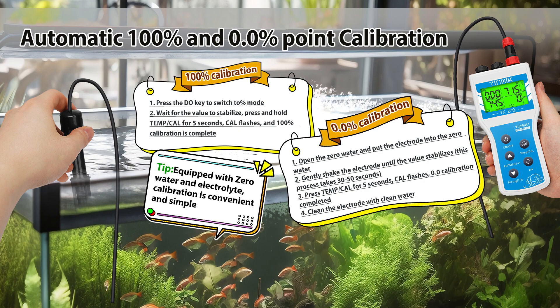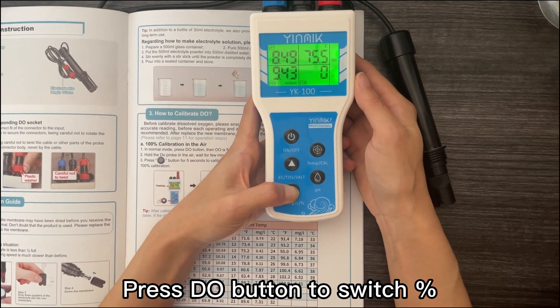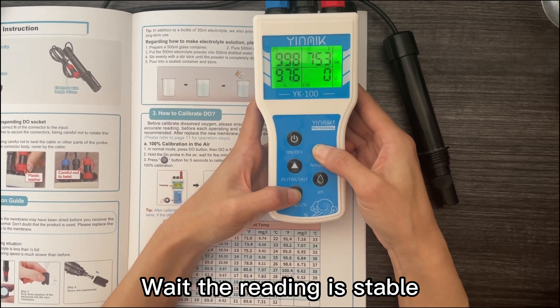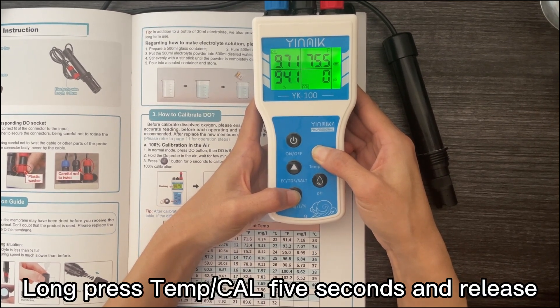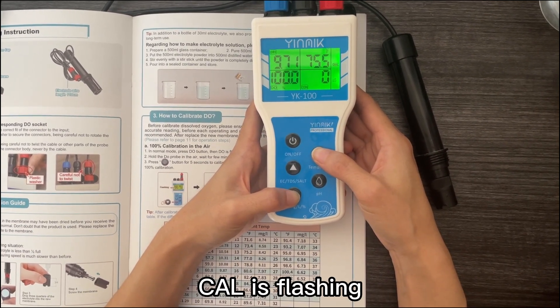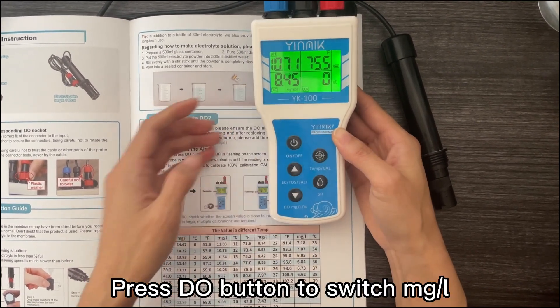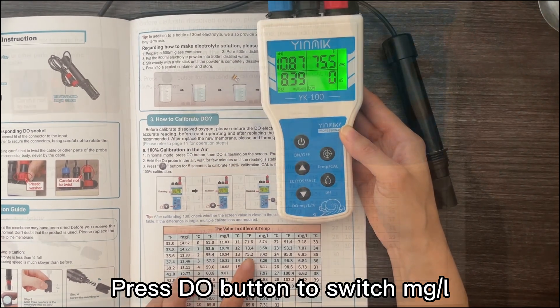Begin to calibrate. Press DO button to switch to percent. Wait until the reading is stable. Long press Temp/CAL five seconds and release. Cal is flashing. 100% flashes two times and calibration is done. Press DO button to switch to milligrams per liter.